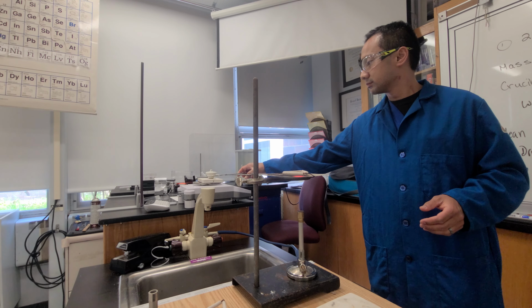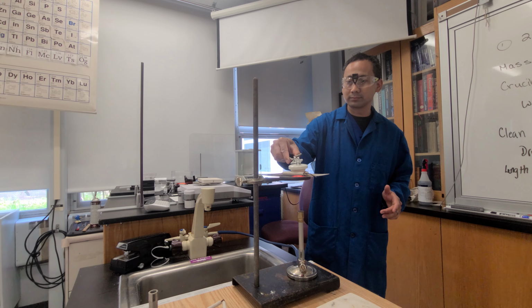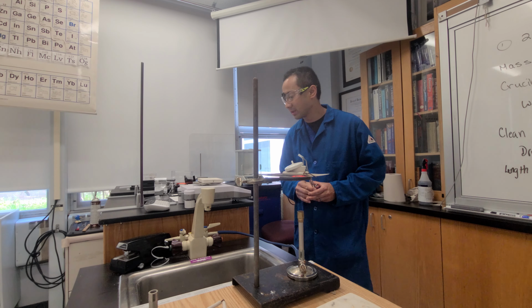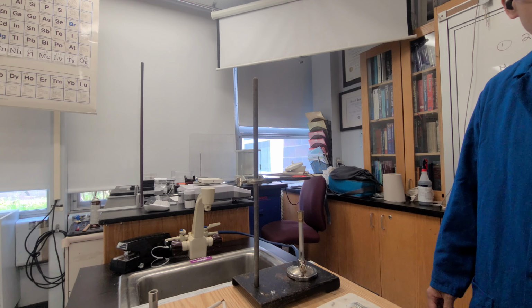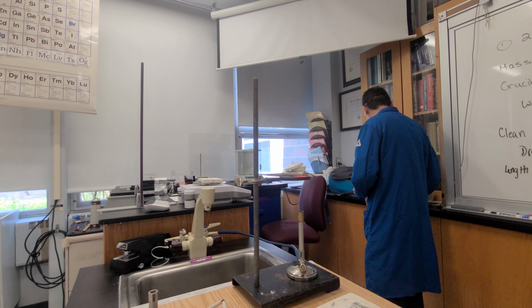So 37.96. I'll make sure that it says 0.0 each time. And I'm putting my tongs on the ceramic plate, just in case it did absorb any of the heat, so I can be aware of that. Just doing a little bit of cleanup here. I have a couple of strips of magnesium.